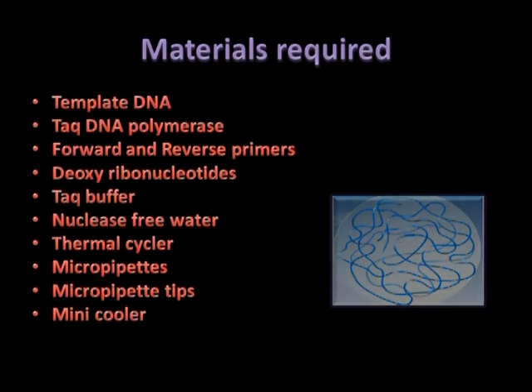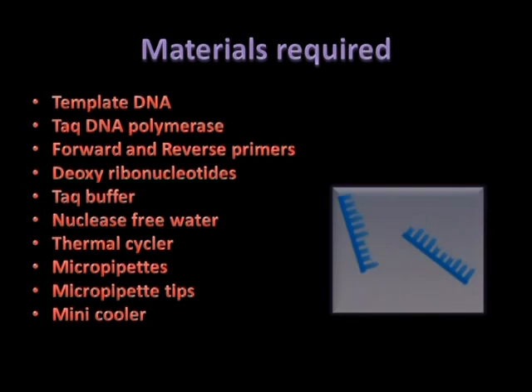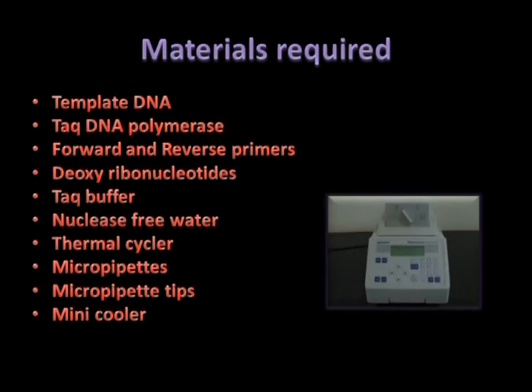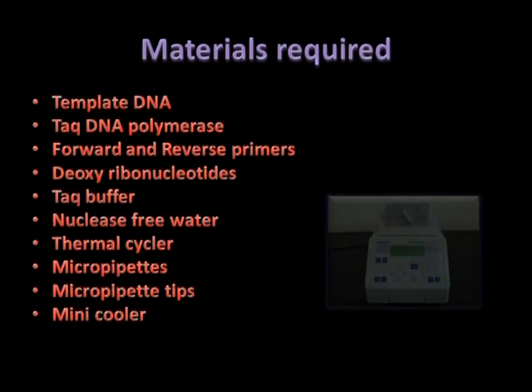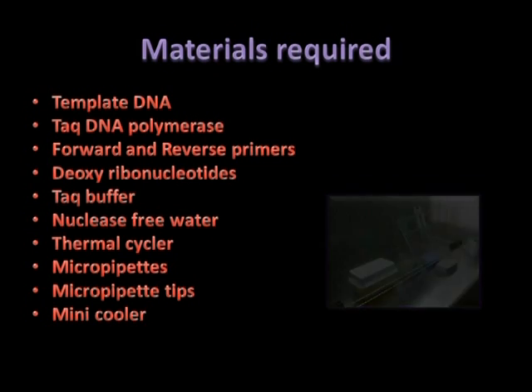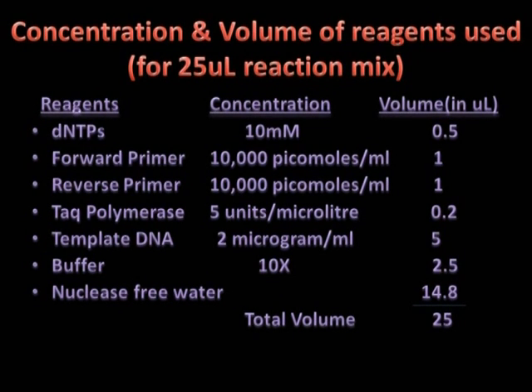Materials required are template DNA, Taq DNA polymerase, forward and reverse primers, deoxyribonucleotides, Taq buffer, nuclease-free water, thermal cycler, micropipette tips, micropipettes, and mini cooler. The concentration and volume of reagents used for a 25 microliter reaction mix are given as below.